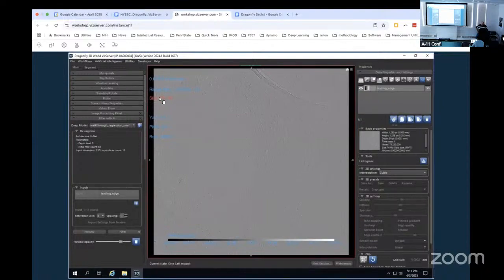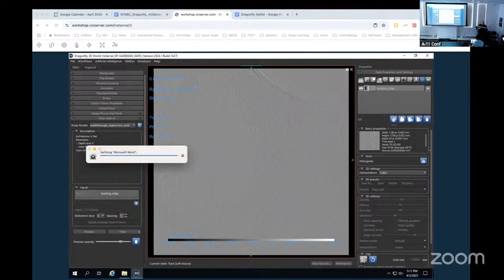But the nice thing about it is that this is a very thin tomogram, so there's not a lot of movement up and down. But when you have a really thick tomogram, you can just hold the thing and scroll right off the top of the screen. And it'll loop around. We'll see it later, but all right, bring this back to somewhere in the middle, something close to slice 25. And we'll look over at the right side of this thing.